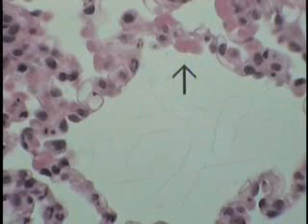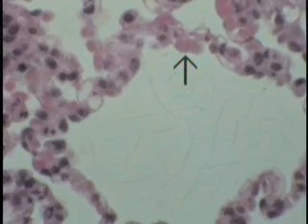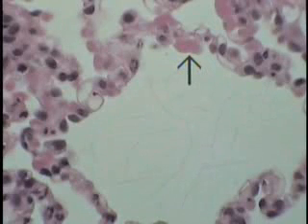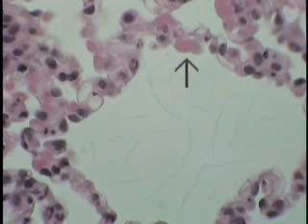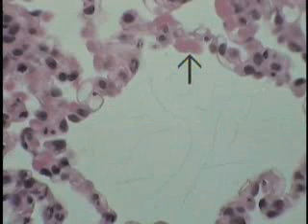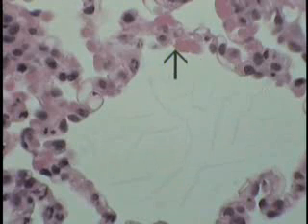Now, if we look up into the wall, this capillary happened to be empty. If we look up further along, you can see erythrocytes within the alveolar wall, but one can still make out, under very careful observation, that little thin hairline membrane just holding in the erythrocytes.